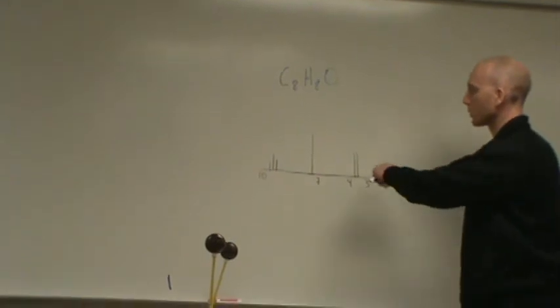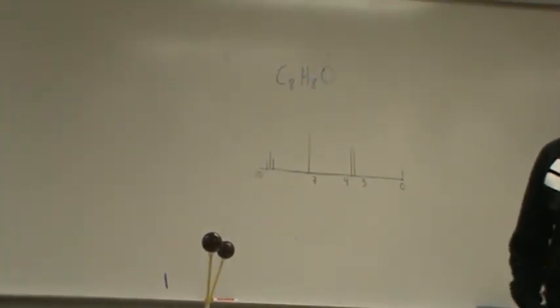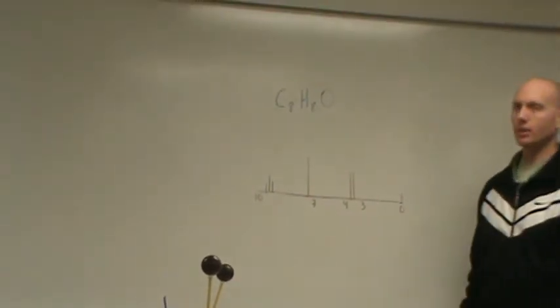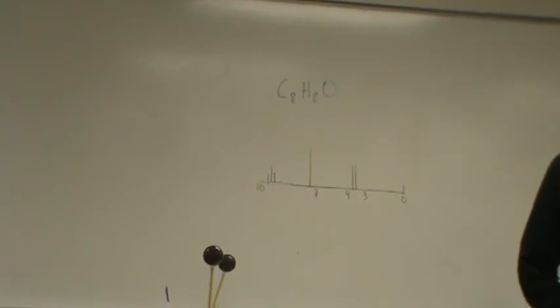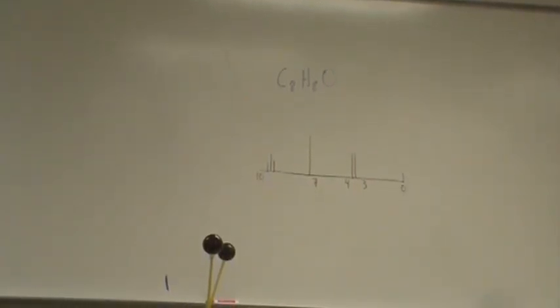Okay, so I redrew it up here, make sure you're seeing that those are doublets. That's it, you got a doublet and a triplet down here. This is a big singlet. You can see the NMR lines aren't as crisp like we draw, so just to help you there.